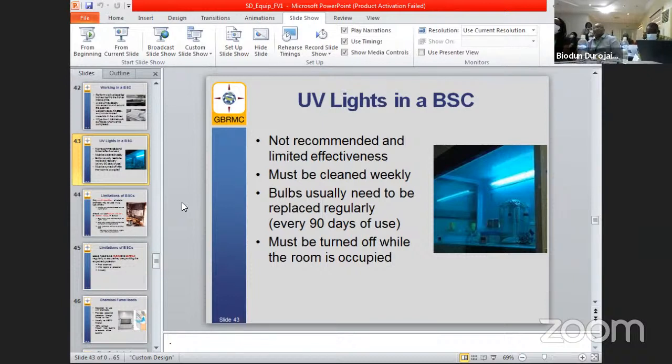So before you apply it to any system and say, oh, I'm using this for this, you have to do some level of validation on that process, to be sure that as you're using it to sterilize your BSC, there is no guarantee that, oh, I'm home and dry. You must have done some level of validation to show that if I turn on this UV for 30 minutes, that environment is sterile and good. Understand? But sometimes we just take things head, book, and center. I say, oh, we both said it, that's the way. No, that's why there is need for validation and also review.